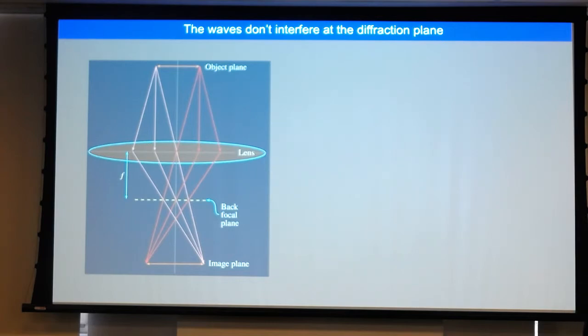What is the phase plate made of, or how does it conduct? People tried to make lots of different kinds of phase plates. The one now is made of very, very clean, thin carbon film. And by mechanisms that are not well understood, the very intense, unscattered beam deposits probably some kind of impurities on the film and charges them up, so it gets an electrostatic charge.